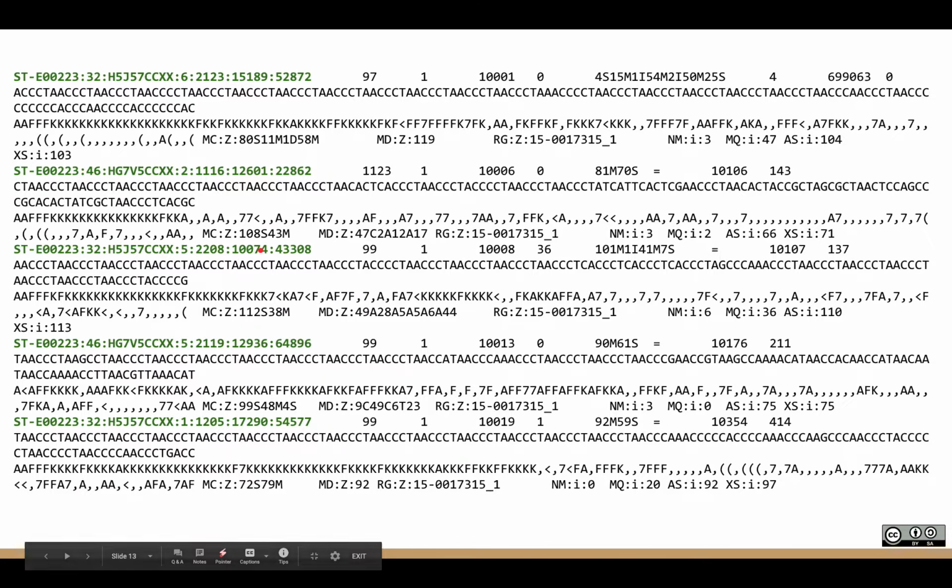But 5 different records, and you can see it's basically just reporting chromosome, position, cigar string, sequence, all this stuff. So this gives us all the information we need to count reads that align to a particular gene, to call ChIP-seq peaks, ATAC-seq peaks, to find genetic variation, everything. How these algorithms work to do that, we'll talk about next week.